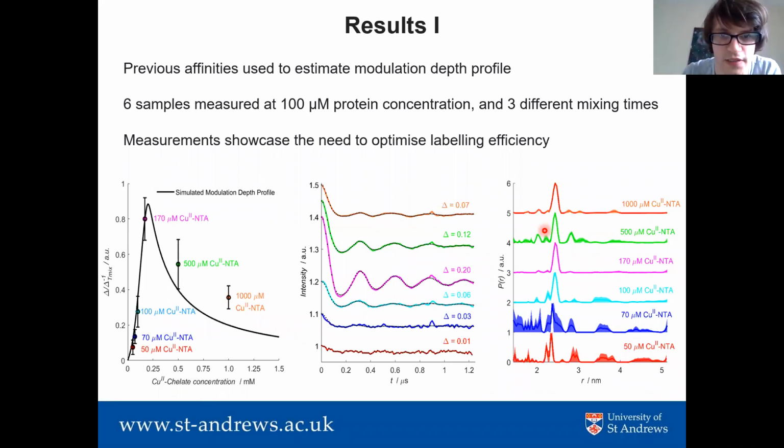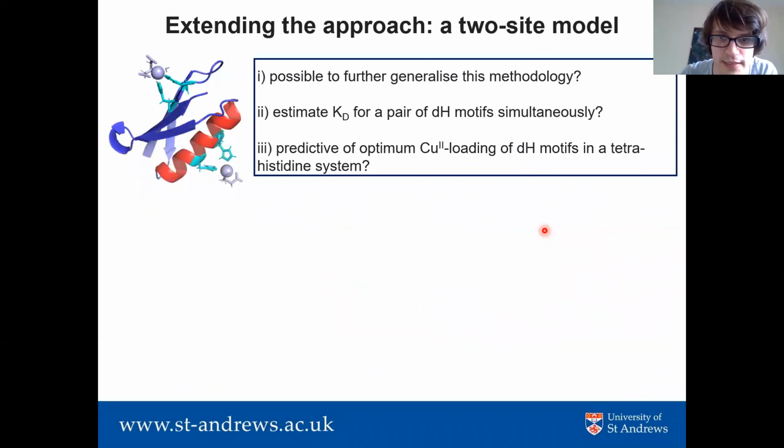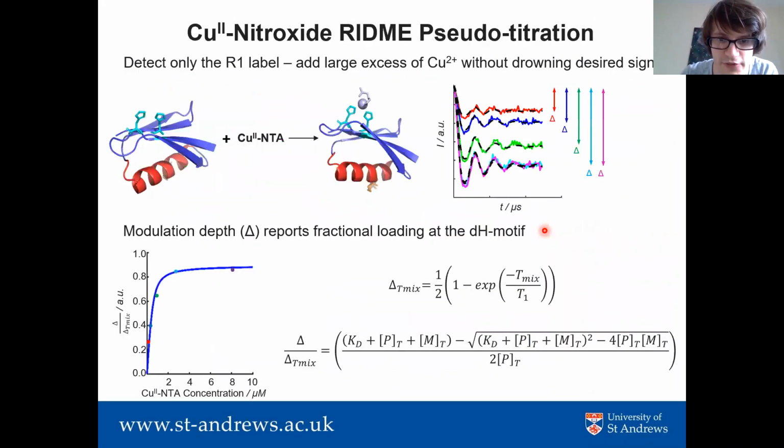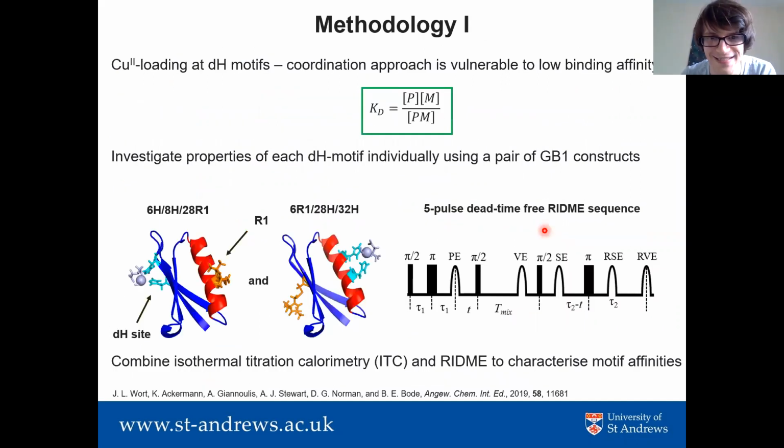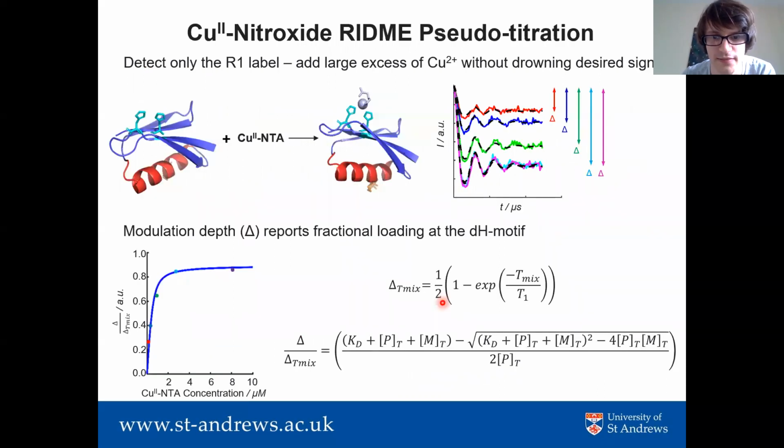That's actually a really good point, and this comes back to the equations here. You are right that your T1 would nominally increase with increasing concentration, and so you need to essentially normalize away that effect.